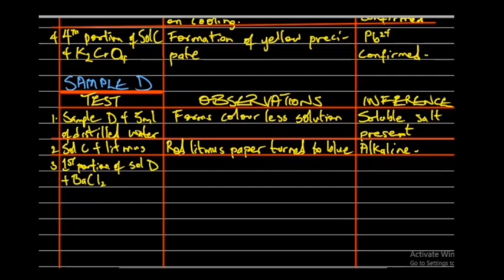We had the formation of white precipitate.